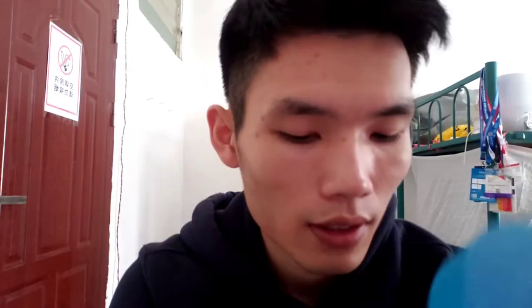Non-woven tapes like this — and why we need some tapes to seal on the fabrics? As you know, the non-woven fabrics they are waterproof itself, and then when we sew it into the custom, this hole which may have been made by the needles here, and then we cover it with this tape so it can be all unibody waterproof again.